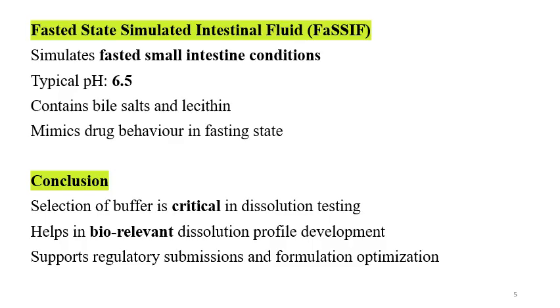The particular pH and the buffer solution composition, ionic strength is finalized and evaluated based on a thorough study: dissolution testing, the properties of the API, solubility of the API, sink condition and sink factors, physiological relevance, PK of the drug, formulation composition, and many other things.